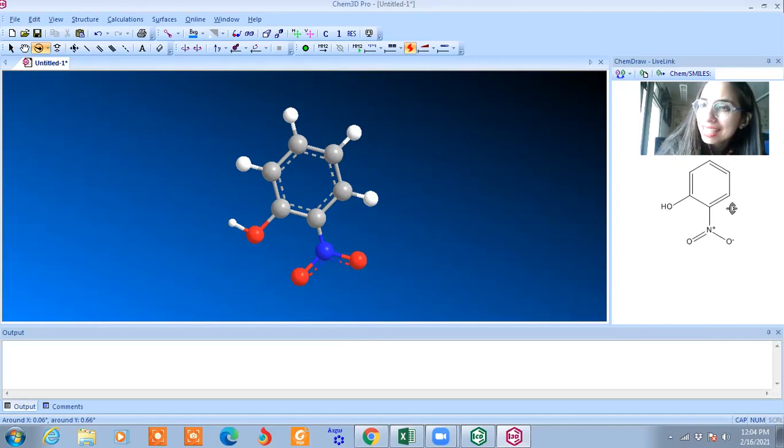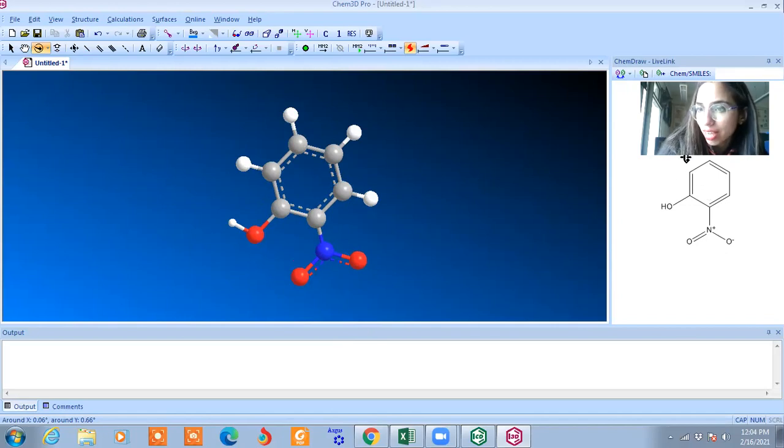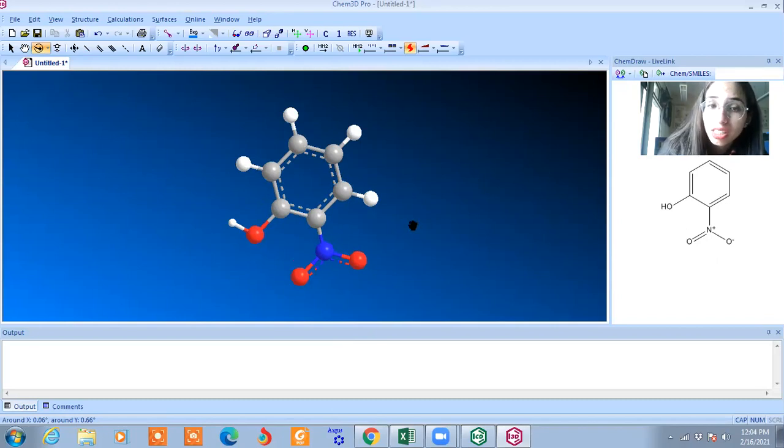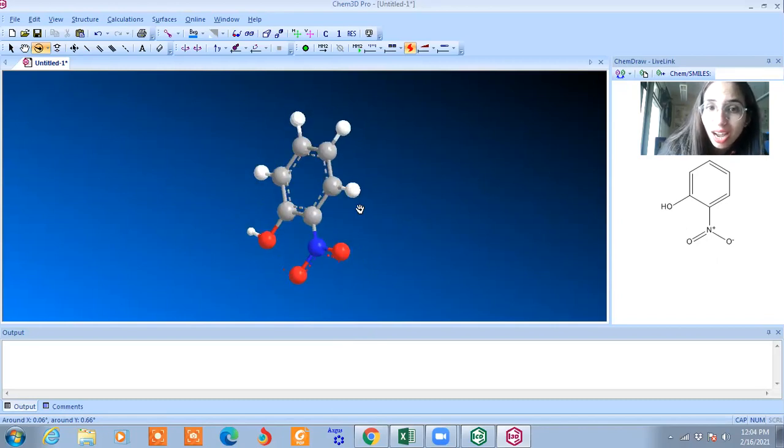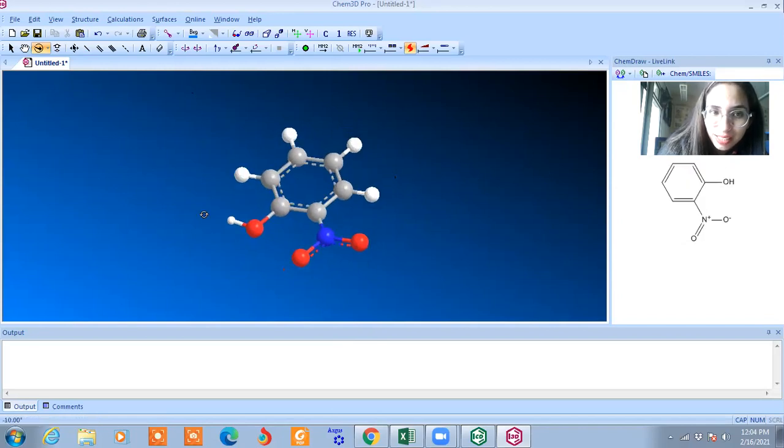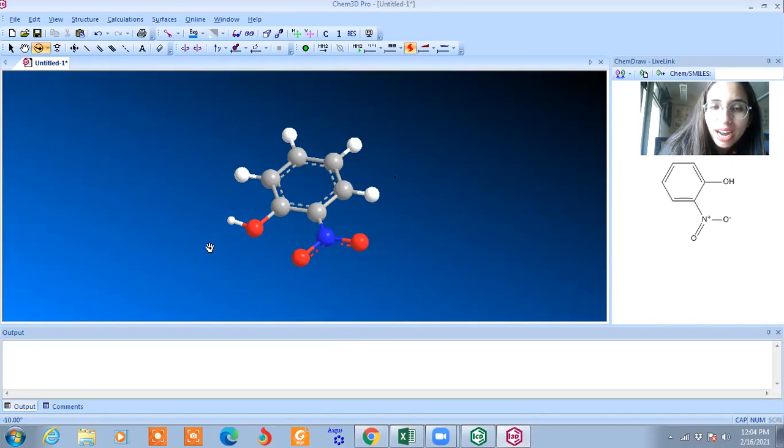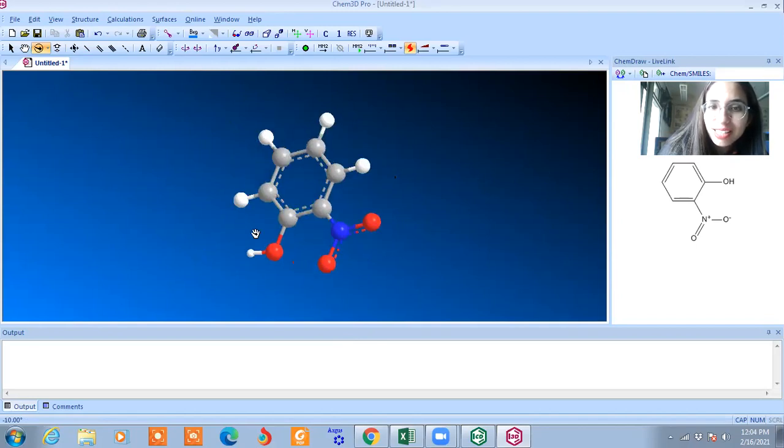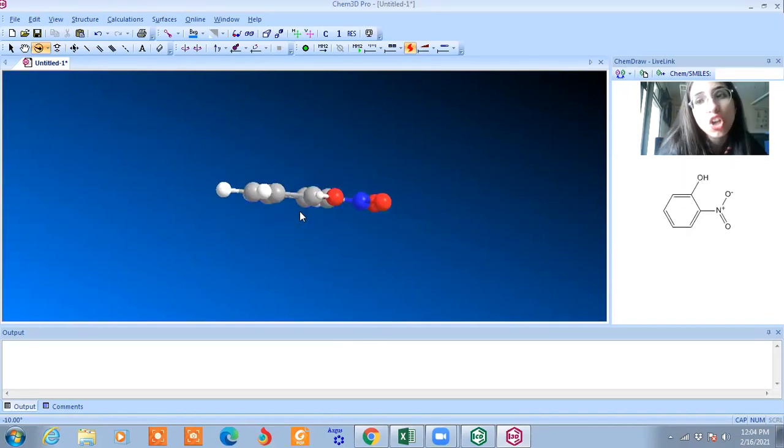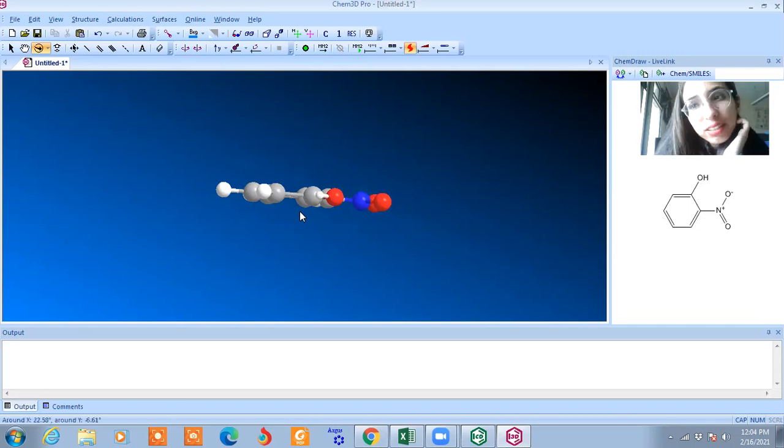Where X and Y axis, the structure is aligned between the two. One is X, this one is X. We know that this is X and this is Y. But here, the structure is aligned between X, then Y, and this is Z. This is all about the basic difference between 2D and 3D structure.